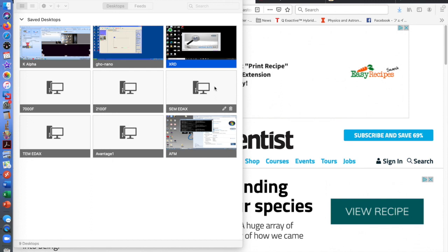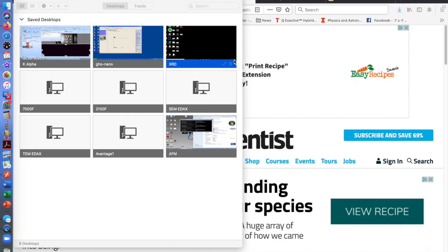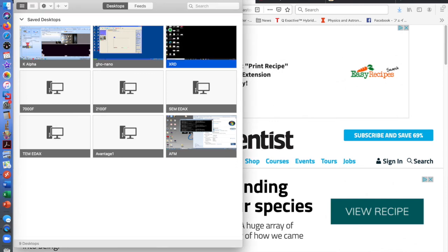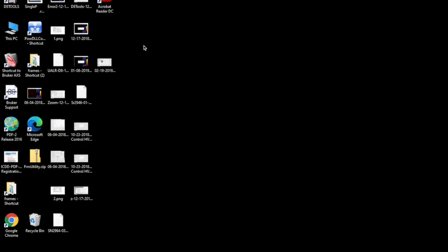Okay, today I am demonstrating how to analyze X-ray data. This is not what we want. What we want is the XRD window. And here, this is the screen we run the X-ray machine, the D8 tools, GADs, and video.